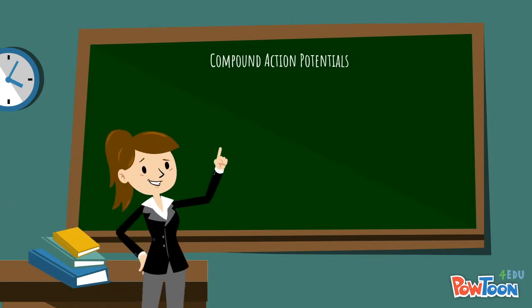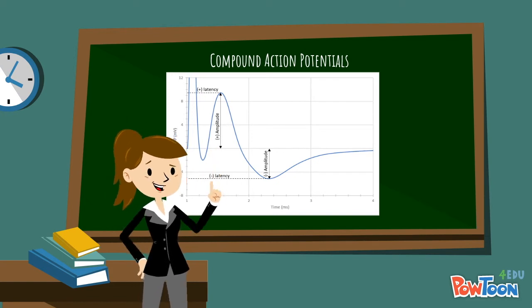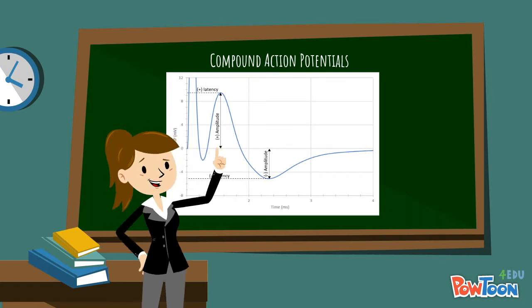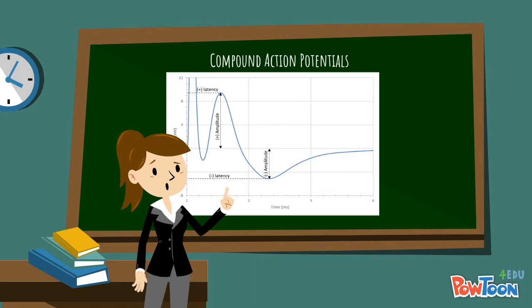A single action potential is generated when a neuron is first stimulated. The stimulation causes sodium channels to open, allowing sodium to travel down its electrochemical gradient. The entrance of sodium into the cell causes the membrane potential to increase. When the membrane potential reaches threshold, voltage-gated sodium channels become activated, causing a depolarization initiating the action potential. As opposed to an action potential, which is an all-or-nothing event, a CAP is the sum of individual action potentials that multiple fibers can conduct.